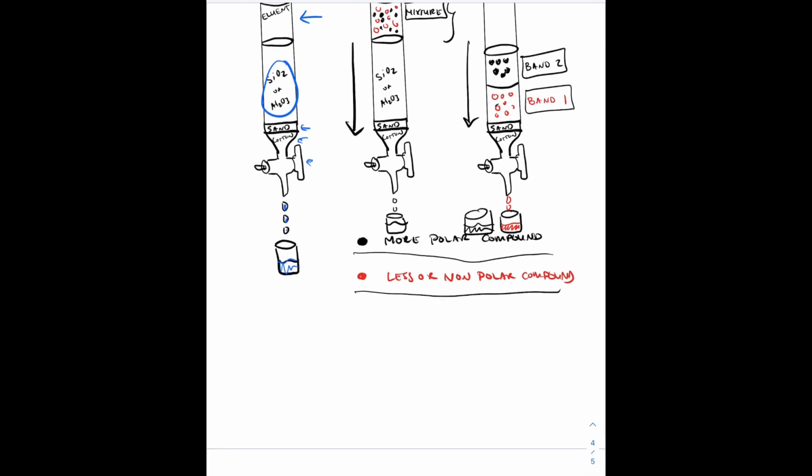And that's why column chromatography is so important and so useful, because you can go through all this work, and when you do an organic chemical reaction, nothing's ever perfect. You don't just put two things in and then get one pure substance out. Sometimes reactions don't go to completion. Sometimes they have side products, and so you can have not just two things, but maybe even like 10 things mixed together, and you have to figure out how to separate them. And so this is a very common method to do that in an organic synthesis lab.